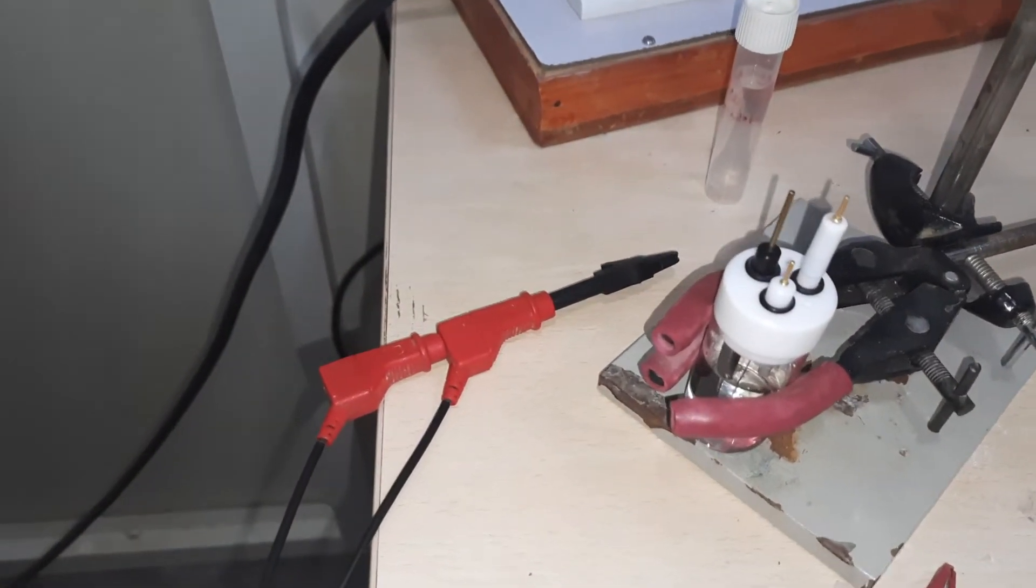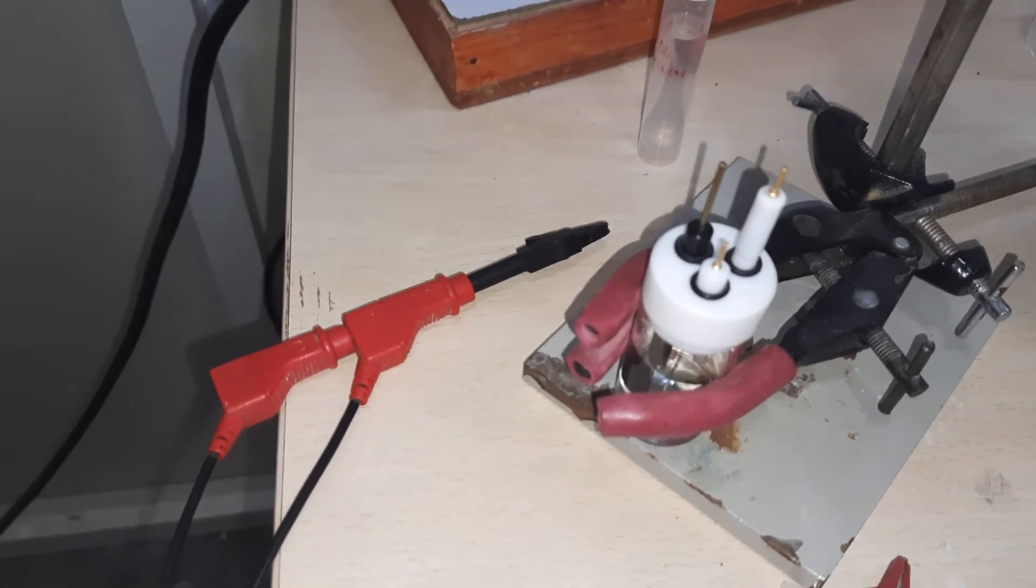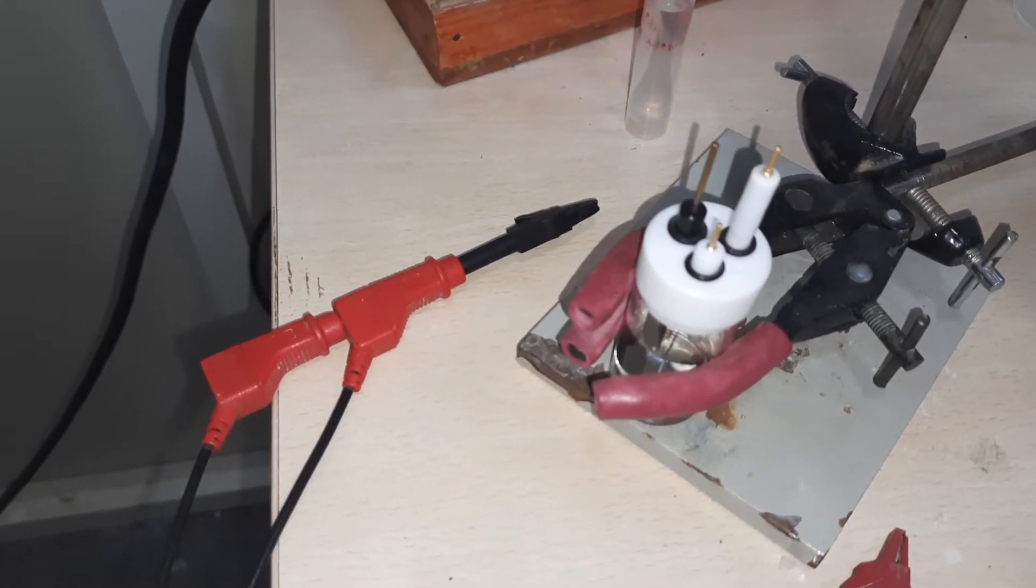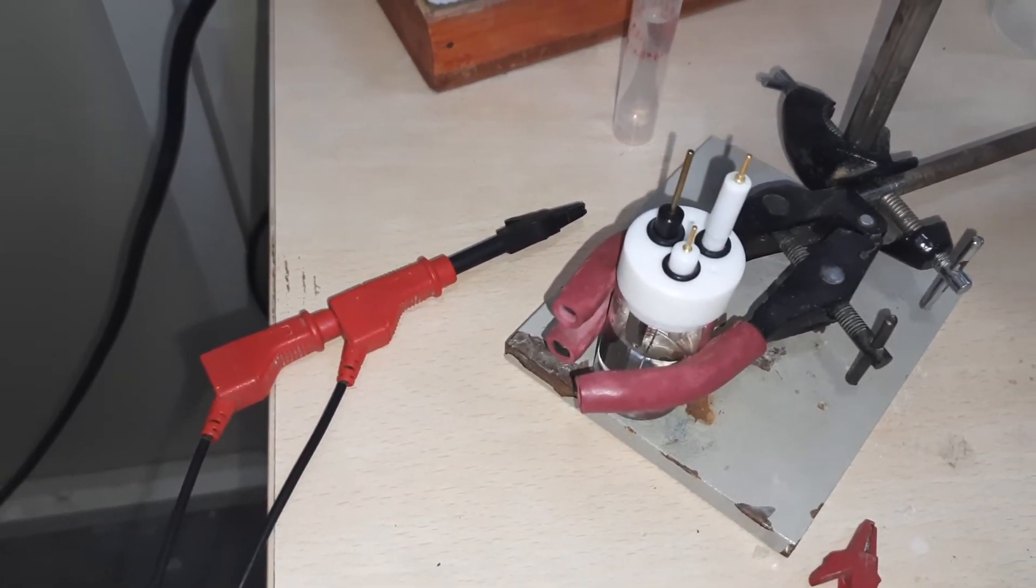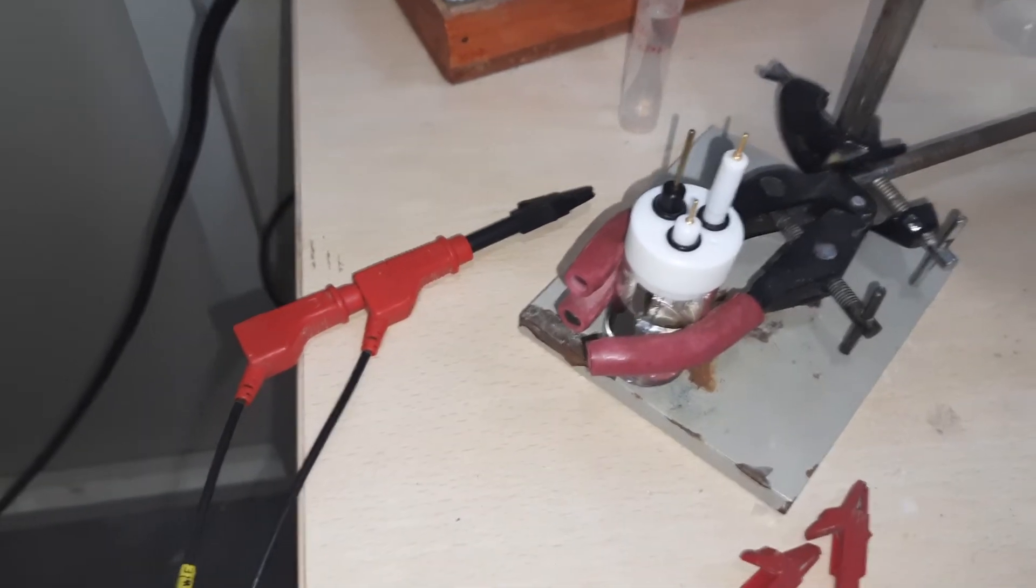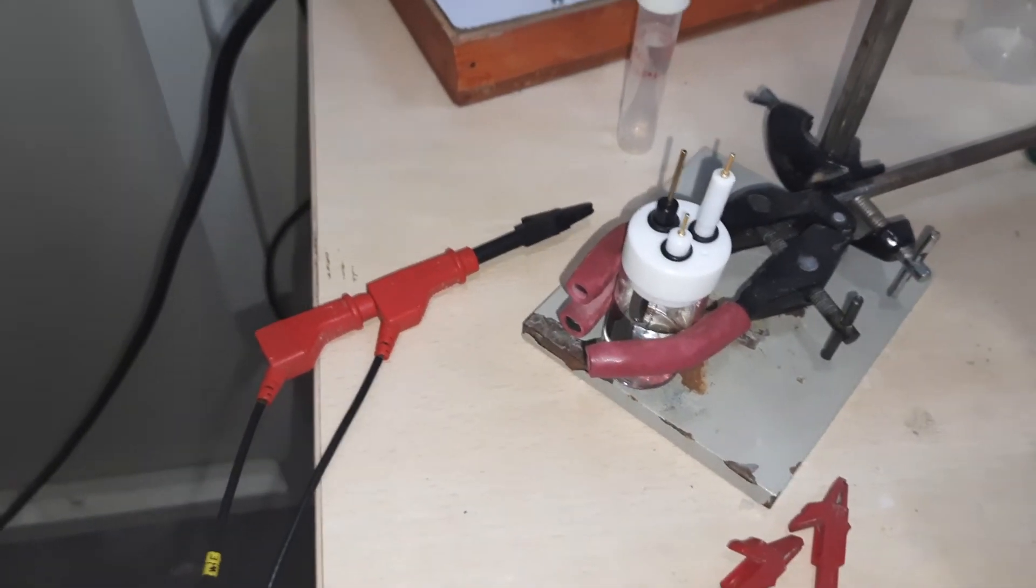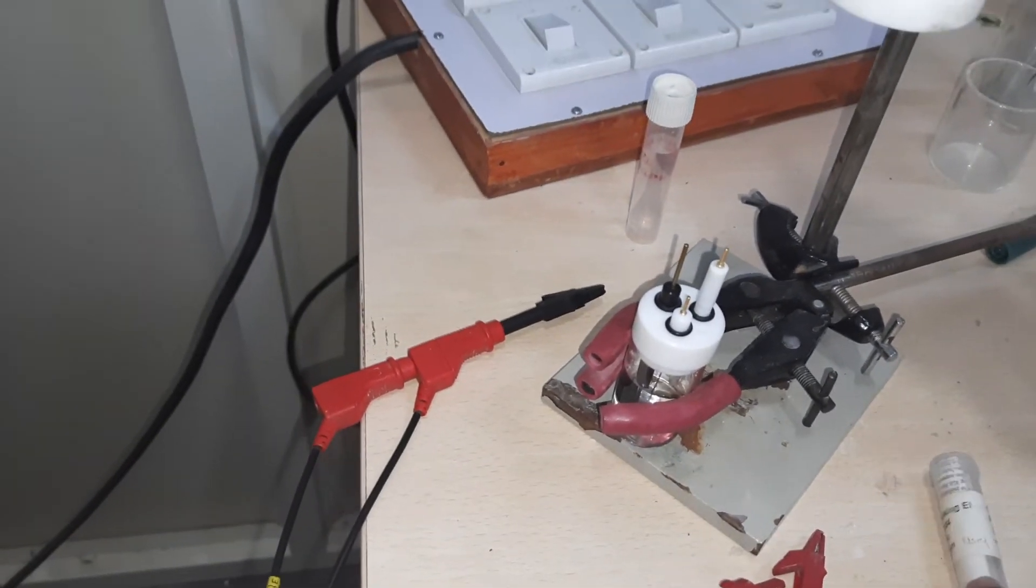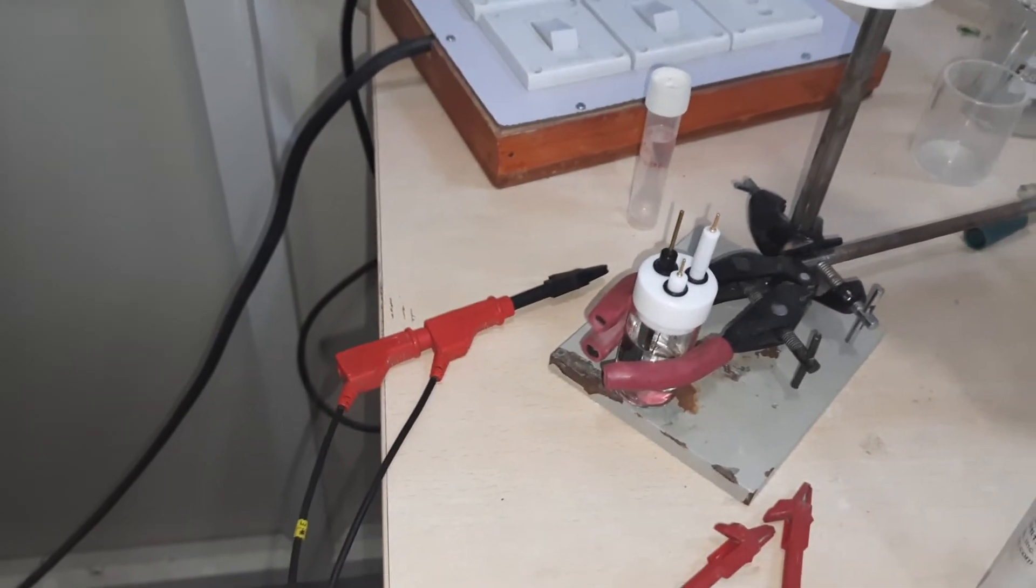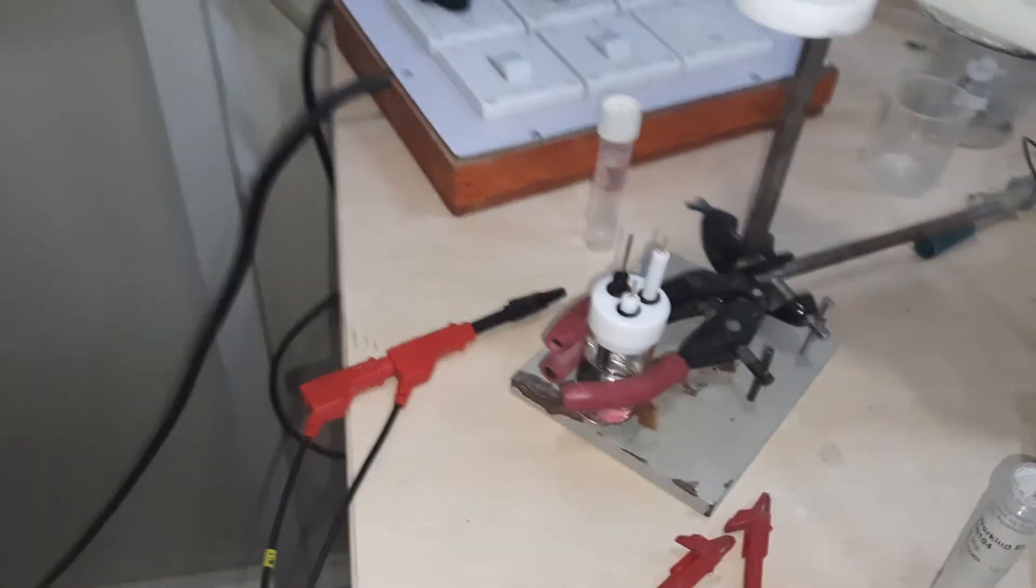The white one is the reference electrode. Let us see the reference electrode first. Yes, this is the reference electrode.